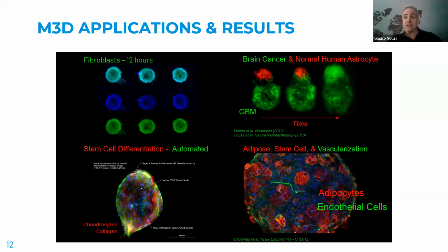What is important here, going back to adding complexity, is that to really recreate the phenotype you're looking for, which is the sprouting of the endothelial cells, we had to titrate the cell number and figure out the right condition where we detected the phenotype. So if you're trying to add complexity, you're going to have to do some optimization. But using magnetic cells really helps with manipulation, because it's easy to move them around and put them together.